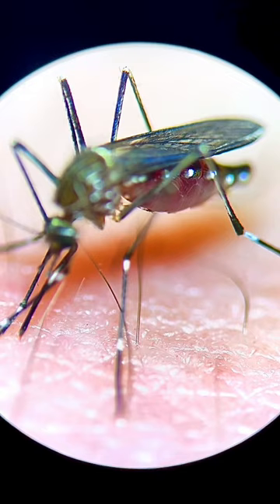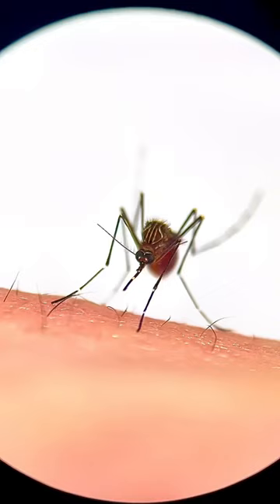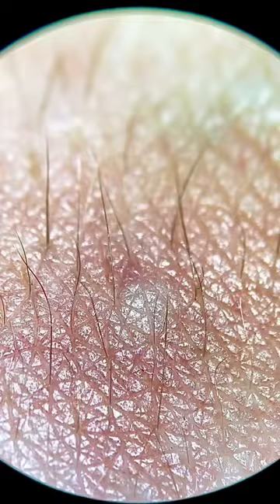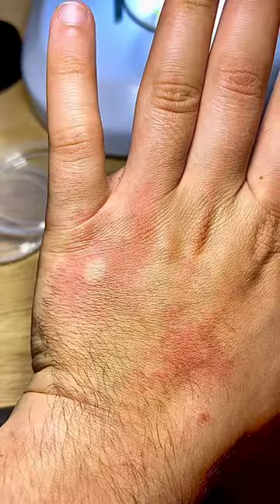The mosquito is full and it is finished. It rests and I start to develop a welt. Over time this gets bigger and bigger. Super itchy. The mosquito victory dances.